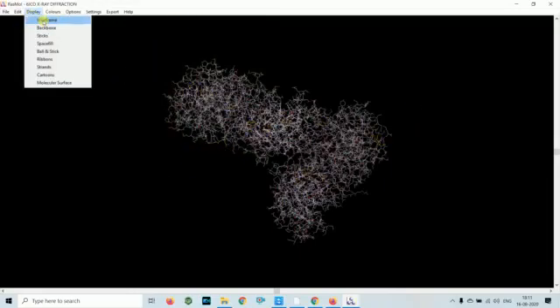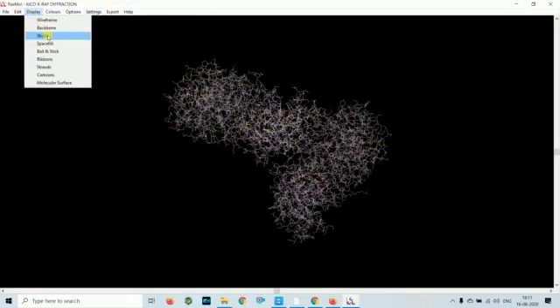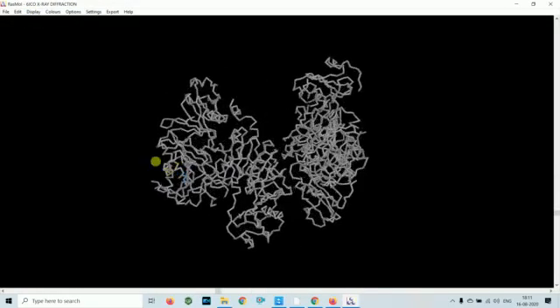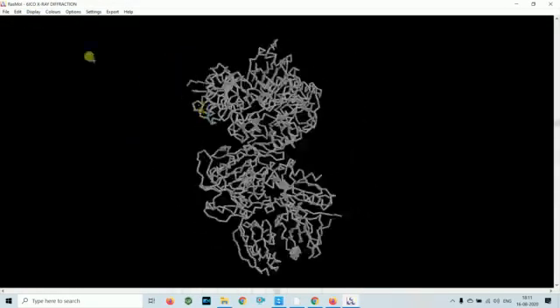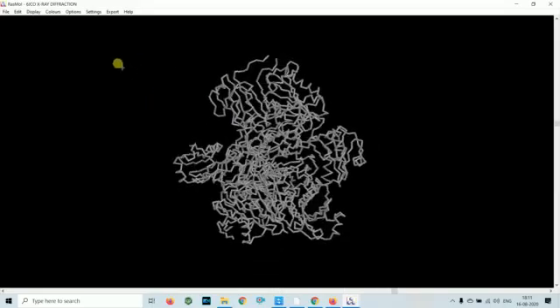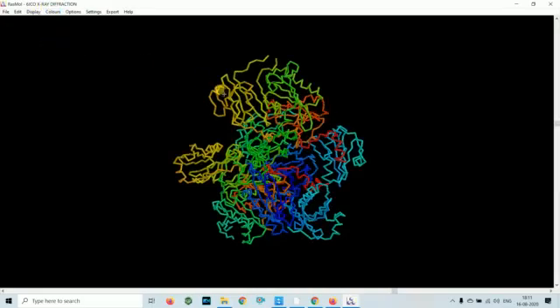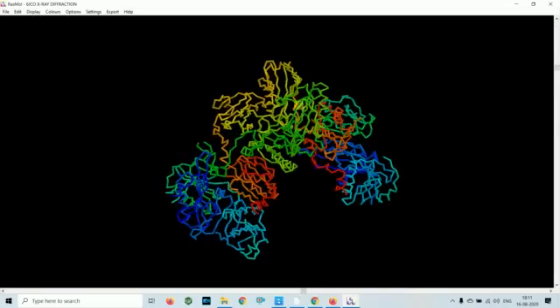You can click on backbone to see the backbone structure. It is showing in monochrome. You can change the colors by clicking on 'group,' so you can see different domains are colored by different colors.